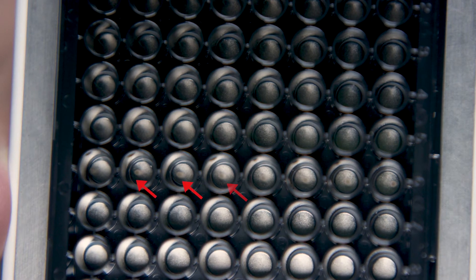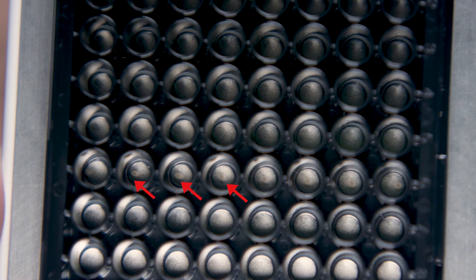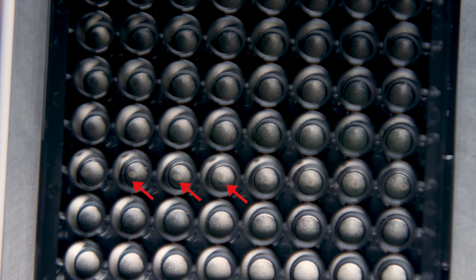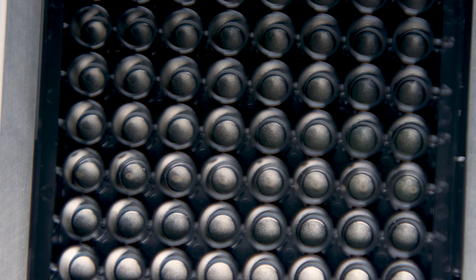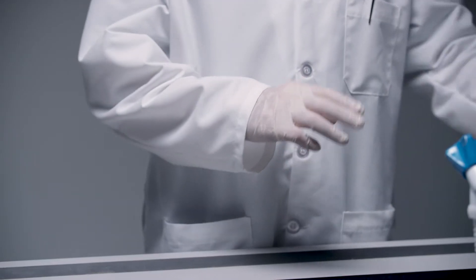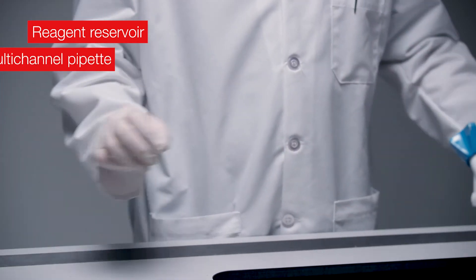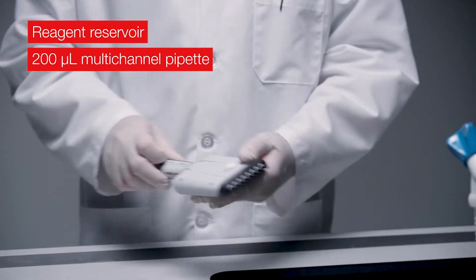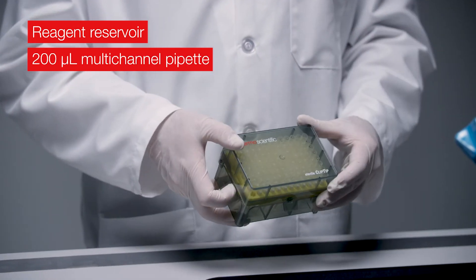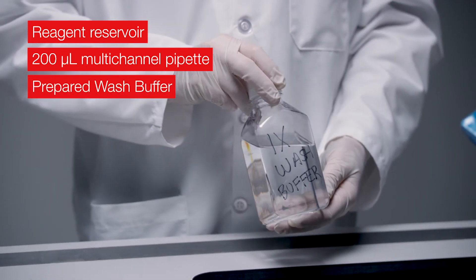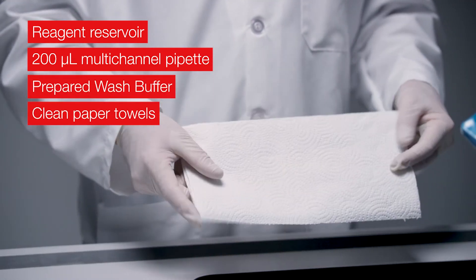Small but powerful round magnets are placed under each well of the plate and will centralize the magnetic beads in each well. To perform the wash steps, you will need additional equipment and reagents: a reagent reservoir, a 200-microliter multichannel pipette with tips, prepared wash buffer, and clean paper towels.